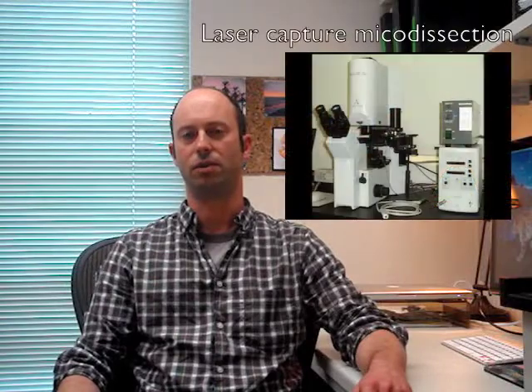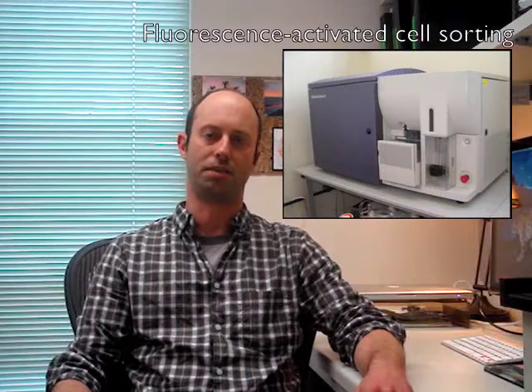Current methods for achieving this end, such as laser capture microdissection and fluorescence-activated cell sorting, have a variety of drawbacks that limit their general applicability. For example, both of these methods require harsh and extensive tissue manipulation. They generally provide low yields at less than optimal purity of the desired cell types. Furthermore, they both use instrumentation that's highly sophisticated and expensive and requires specialized technical skills to operate. Given this situation, we wanted to develop a new method that would be easier to use and would be approachable by all researchers in the field. Here's what we came up with.